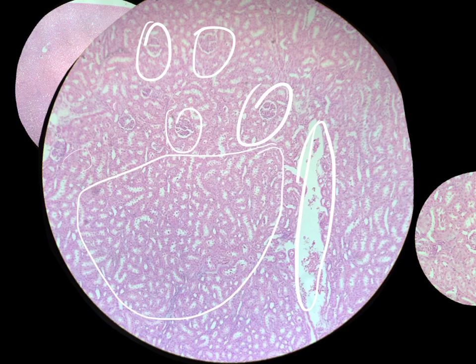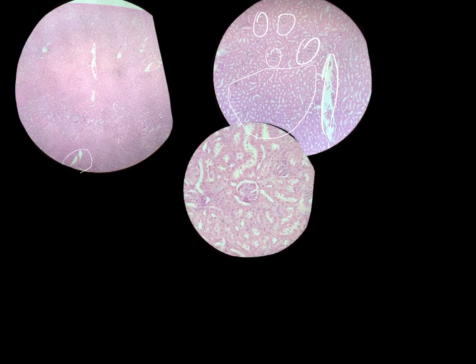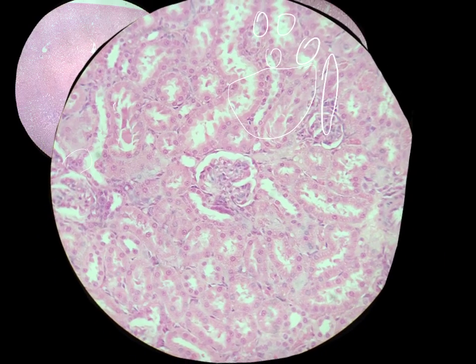About 85 to 90% of the tubules, maybe even more in the cortex, are proximal convoluted tubules. And so everything inside of that circle that I just drew, almost every single one of those are proximal convoluted tubules. These are big tubules, they kind of have a blurry border, meaning it's not a nice clean edge within its lumen.